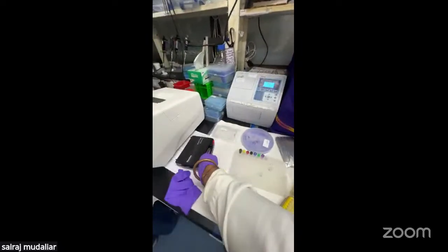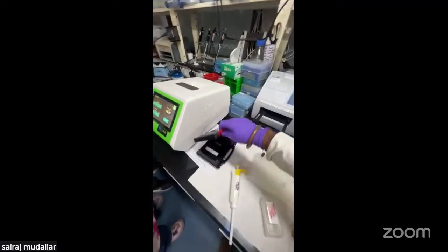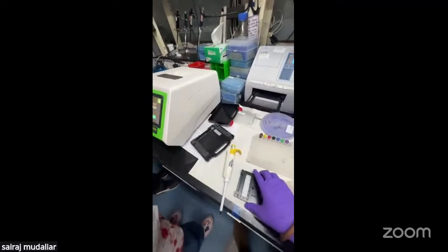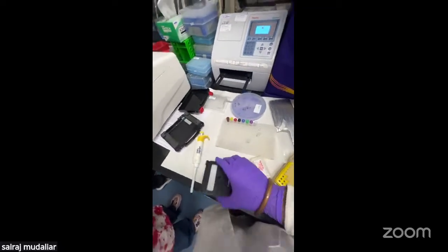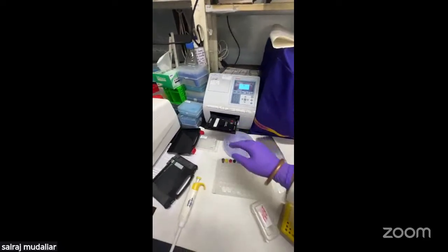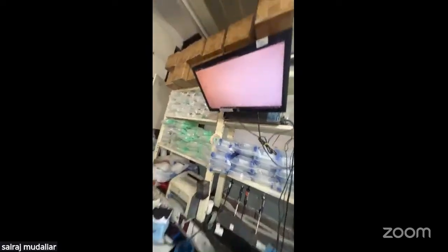So this is how the plates look. This is a microdrop plate reader. We generally place our peptides here. Once the peptides are loaded, 2 microliter of peptide is more than enough, we place the microdrop plate and let it move inside. This is our in-house generated protocol. So this is how the parameter settings look.